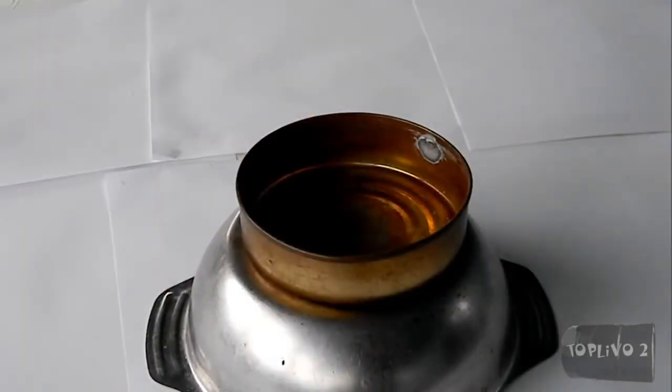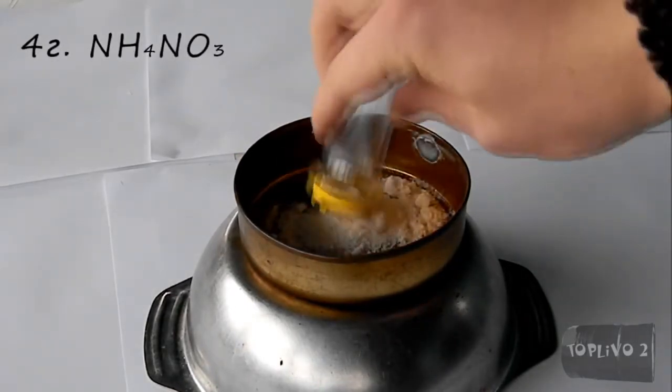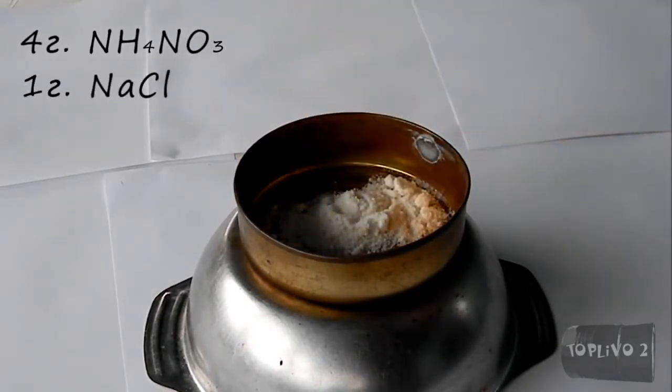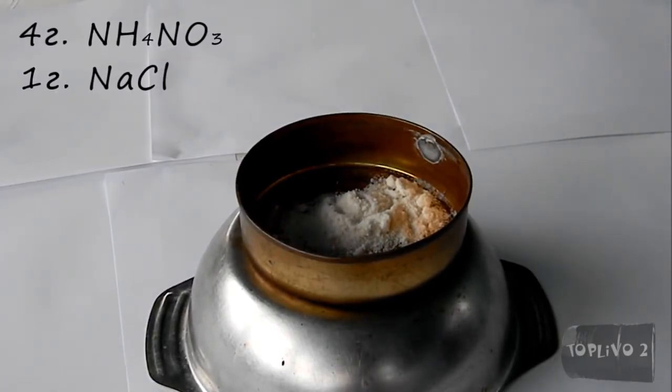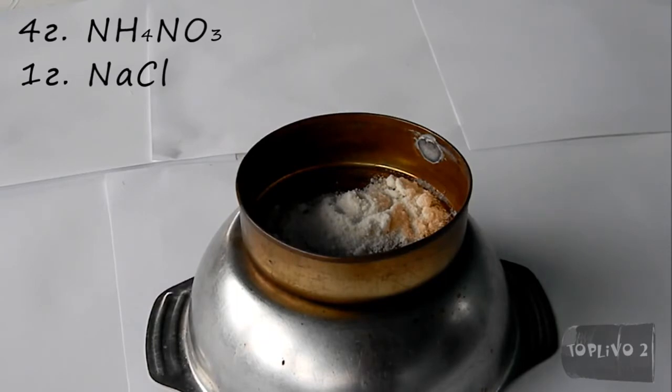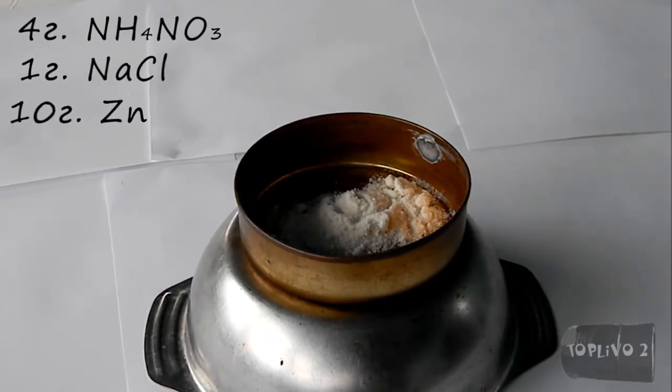And the last reaction. Pour a mixture which consists of 4 grams of ammonium nitrate and 1 gram of sodium chloride, i.e. table salt. All components were thoroughly ground. Add 10 grams of zinc powder to this mixture.